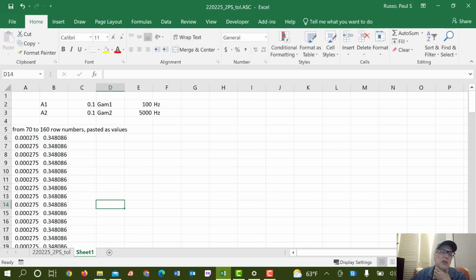Now look, I've already set this up with some variables, A1, amplitude 1, 0.1. And you see it has a defined name there, ample 1. Amplitude 2 is called ample 2. Gamma 1 is called gamma 1, and gamma 2. And it's good to give units for these things. These will be in hertz. Since I want those to be in hertz, I should probably convert all of these.